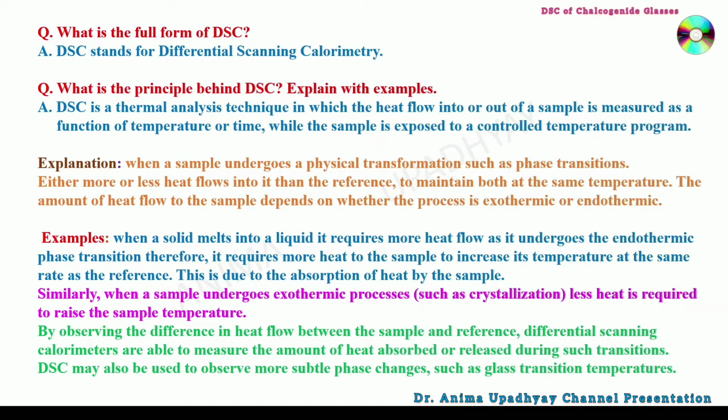I have formatted this video in the question answer format for better understanding of the subject. Let us begin with the full form of DSC. It stands for Differential Scanning Calorimetry. What is the principle behind DSC? Explain with the help of examples.